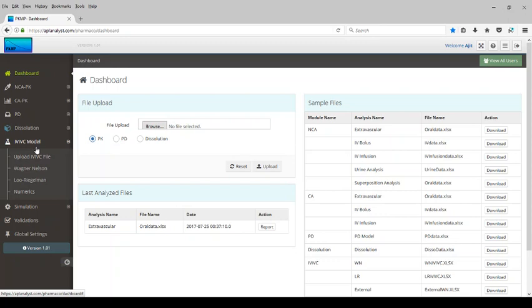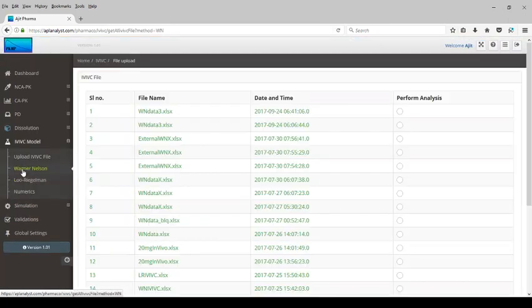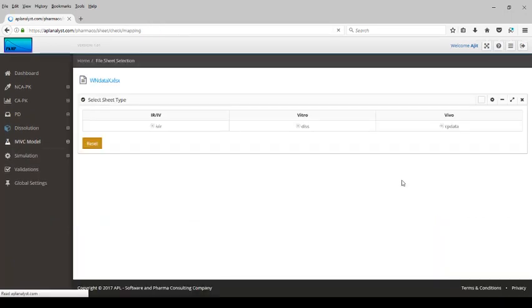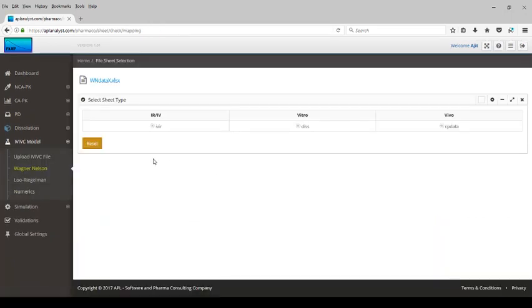We will select the Wagner-Nelson method. I have already uploaded a file and we will select that file. As mentioned, the file has three components: IV-IR, dissolution, and in vivo data.